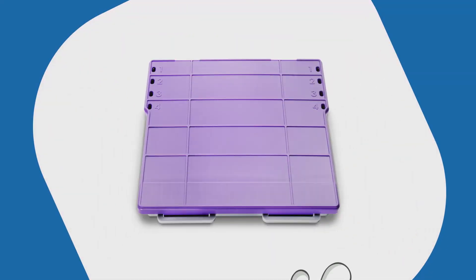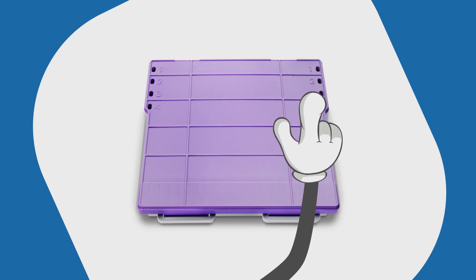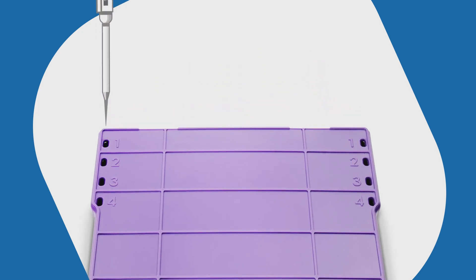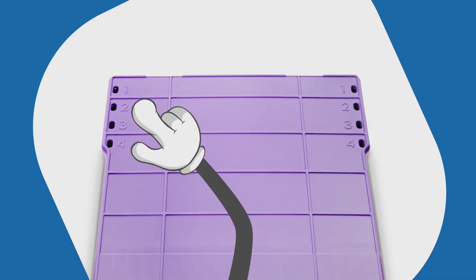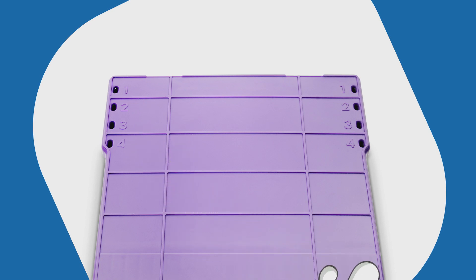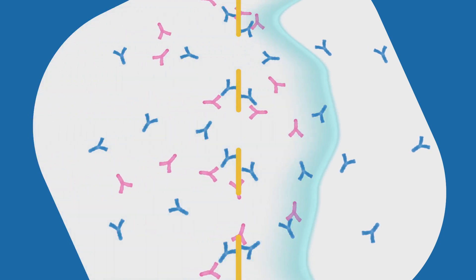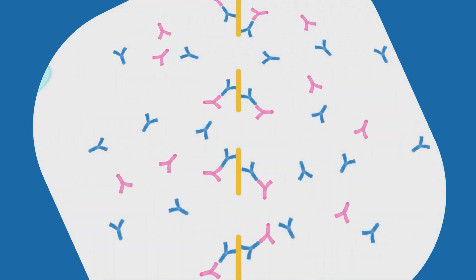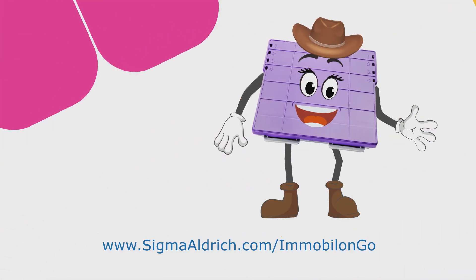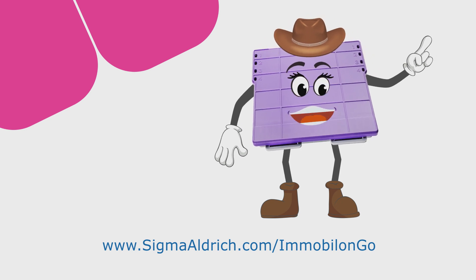With your membrane in position, it's time to turn your attention to my loading ports. Just add blocking buffer to each loading port to initiate lateral flow across your membrane. Then add your primary and secondary antibodies to ports one and two. Ports three and four are for your two final washes with TBST. Here's a peek into what goes on inside the cassette — it's just like your standard time-intensive method, only way better. Three hours and next to no hands-on time for your next immunoblot detection protocol.